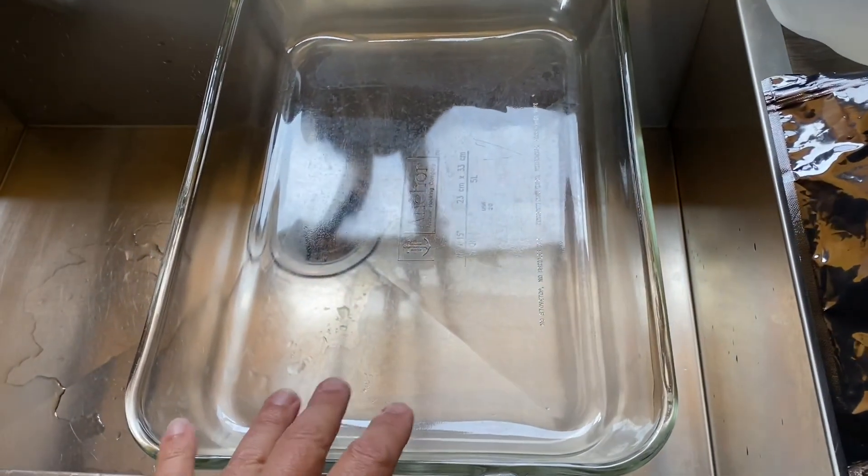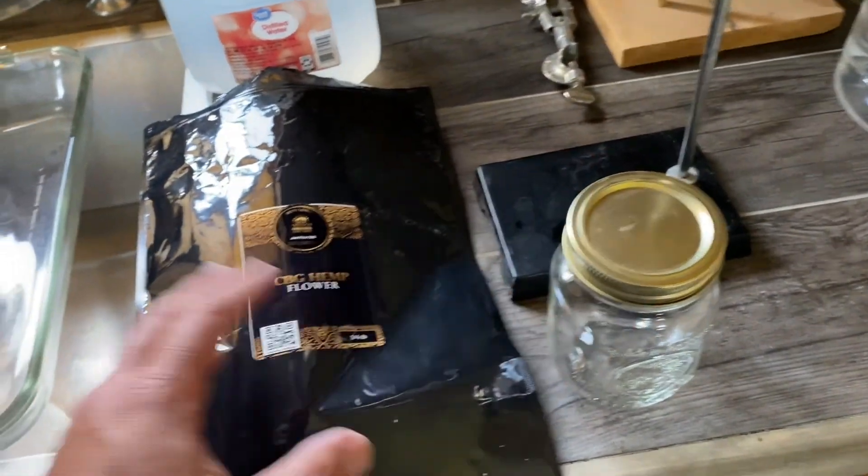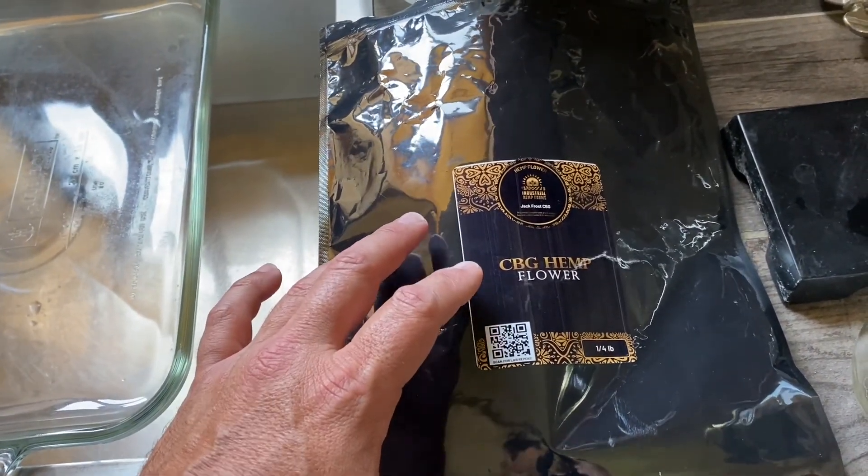And you'll need a glass or a ceramic plate, and you'll need a mason jar, and of course you'll need CBG hemp flower.